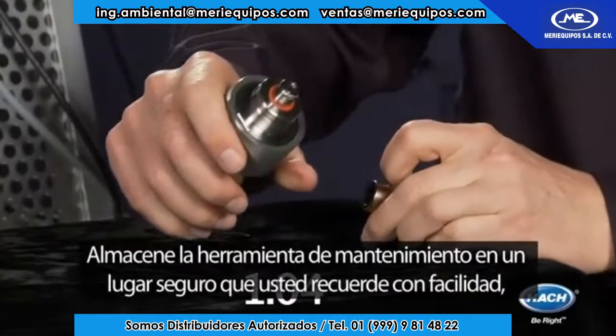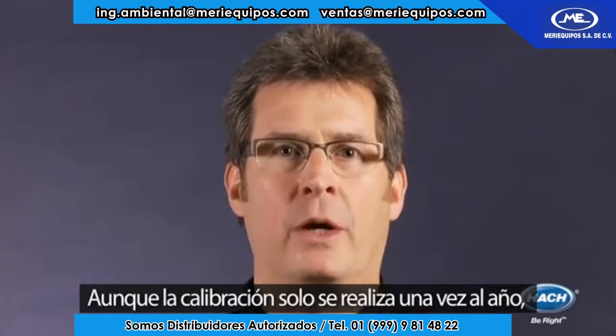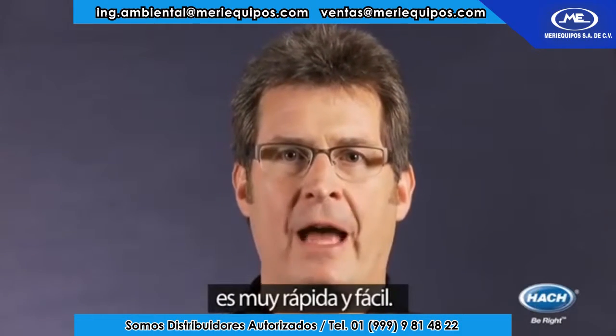Store the maintenance tool in a safe place you will remember, as you will not use it again for a year. Calibration only happens once a year and is also very fast and easy.